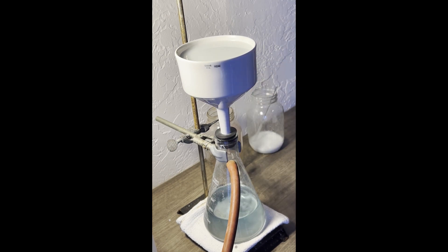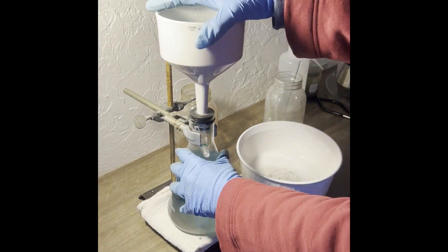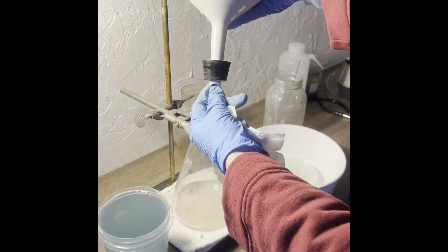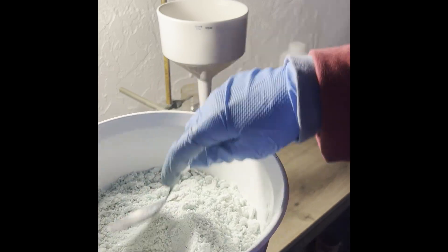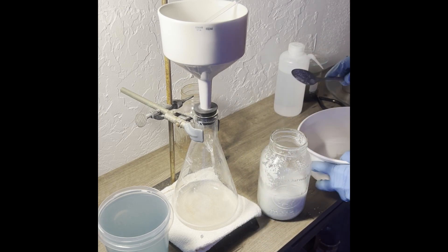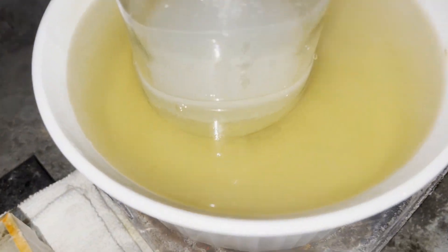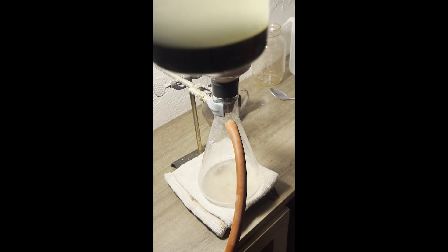I'm using denatured alcohol because it's cheap and ferrous sulfate is practically insoluble in ethanol and apparently methanol as well. Just letting the heptahydrate sit in the jar with denatured alcohol overnight dehydrated it to some extent, as you can see from the decreased green coloration in the solid. I transfer the filtered ferrous sulfate to a jar and fill it about halfway with denatured alcohol, then suspend it in a water bath and boil until about half the alcohol evaporates. This serves as a much simpler dehydration step than thermal dehydration, which requires a temperature of at least 300°C.